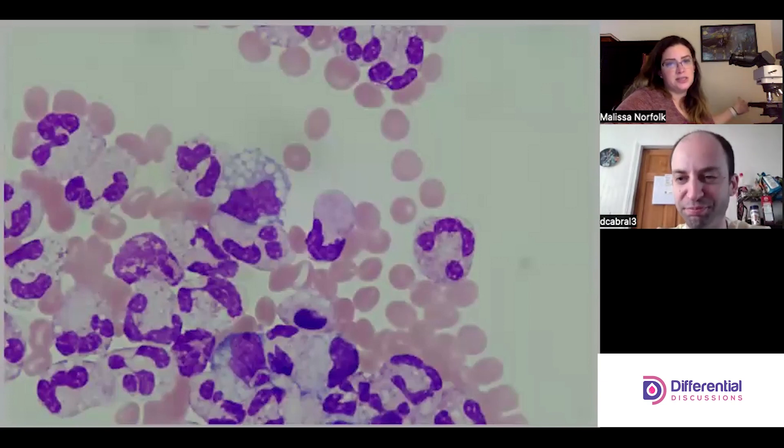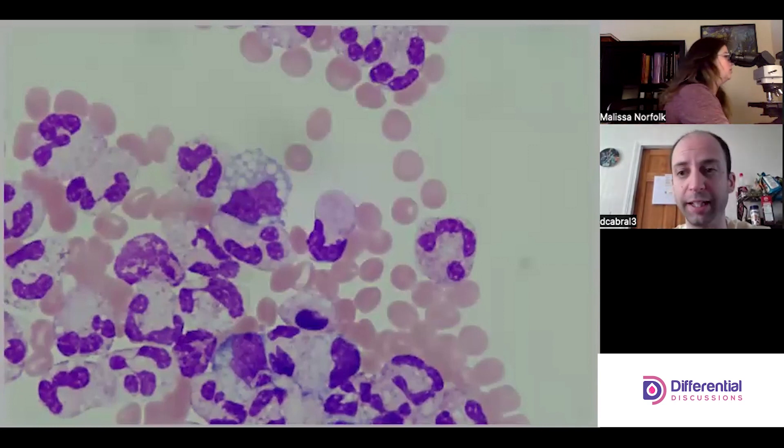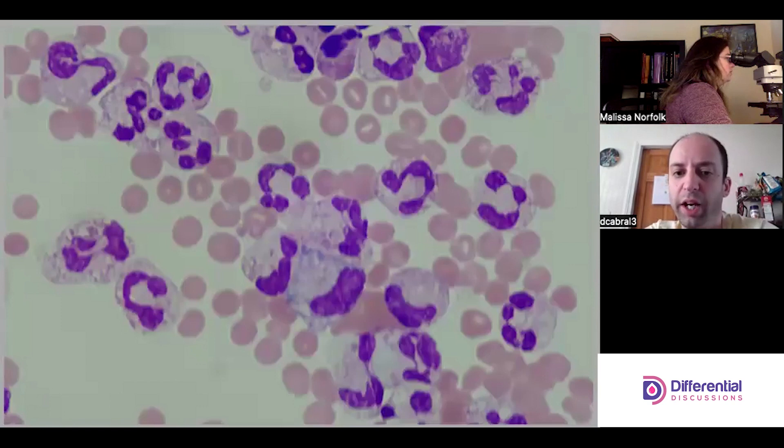It's typically not a malignant cell because we don't typically see malignancies in synovial fluid. I've looked at a lot of joint fluid and I've never seen a malignancy in joints — not to say it's not possible, but it's just not what you commonly look for in joint fluid.